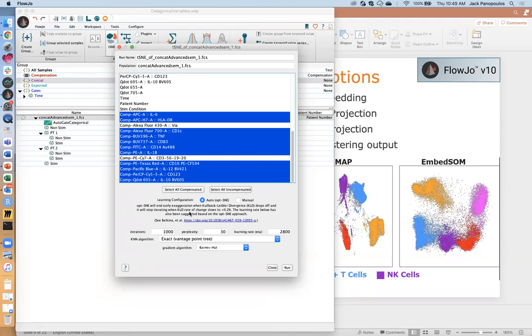It's a very good modification because it speeds t-SNE up and gives you the result in a much shorter amount of time than you would have to wait for the original implementation. You could test this by switching to the manual method and running the output, then doing the same thing with opt-SNE and seeing how quickly you get results.